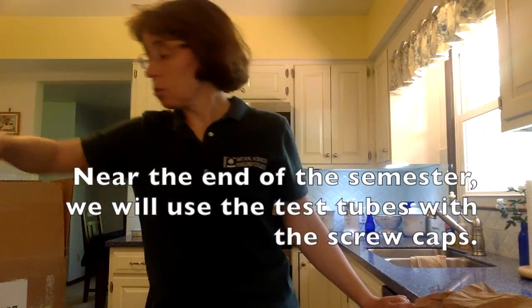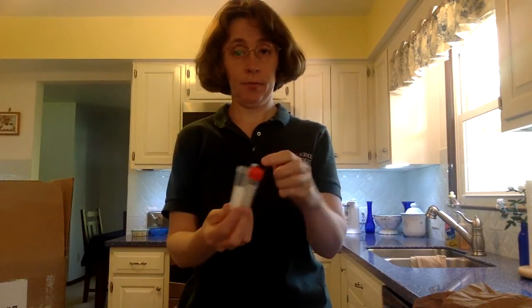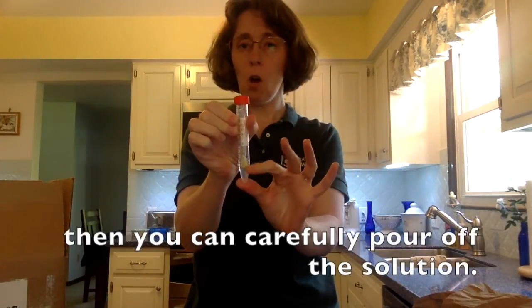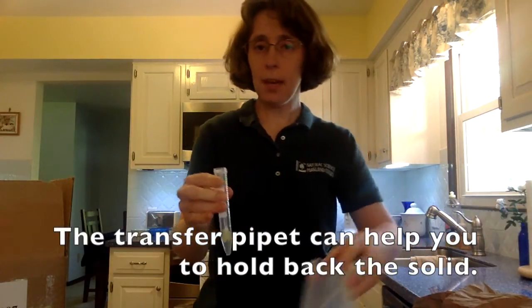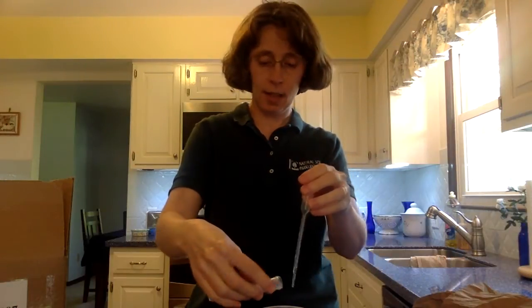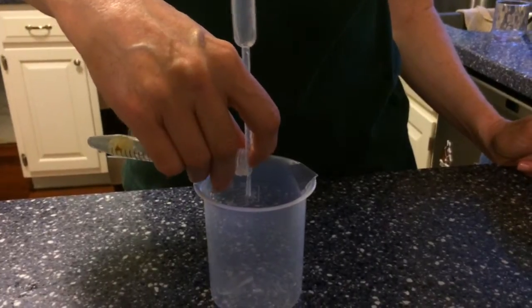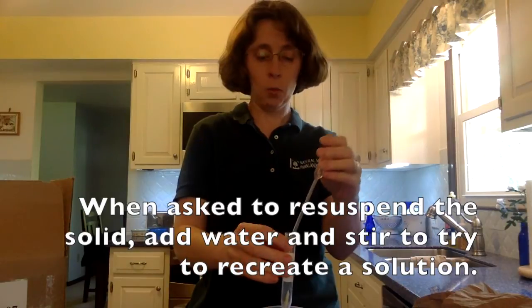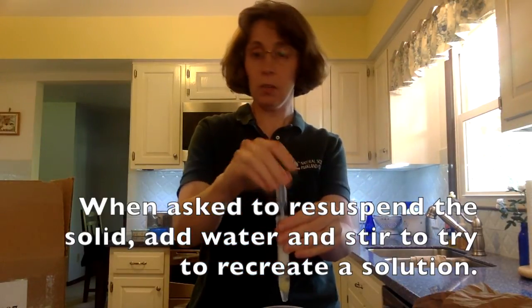Near the end of the semester, we will use the test tubes with the screw caps. If you have both a solid and a solution in a test tube, then you can carefully pour off the solution. The transfer pipette can help you to hold back the solid. When asked to resuspend the solid, add water and stir to try to recreate a solution.